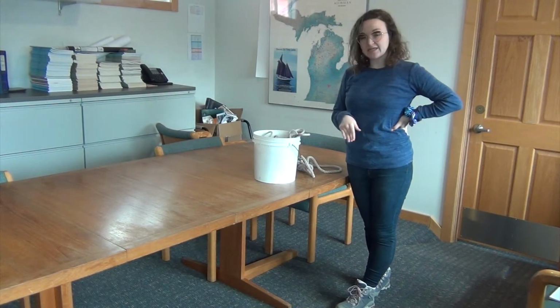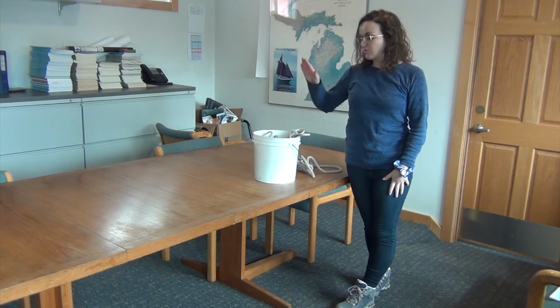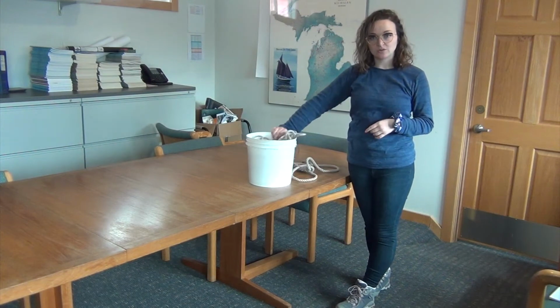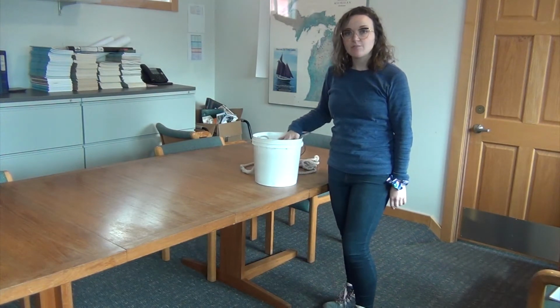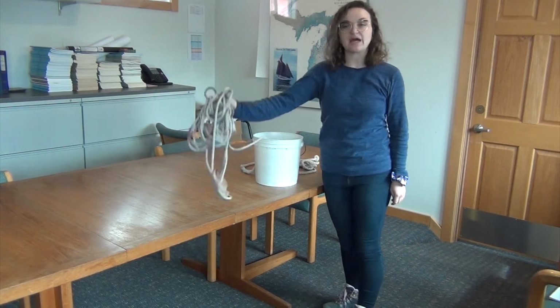using our Secchi bucket, our Secchi sampling materials. Our Secchi sampling materials include the Secchi packet as well as this white bucket here that holds our equipment. So there's this longer rope, keep this out of the way. Once you're ready to start your Secchi sample, you're just going to pull this rope on top out in a couple of fistfuls and pass it to the side.